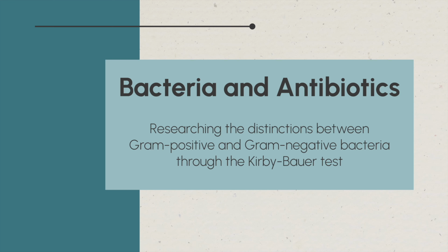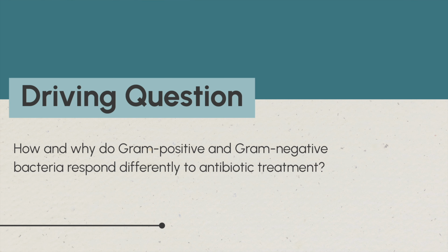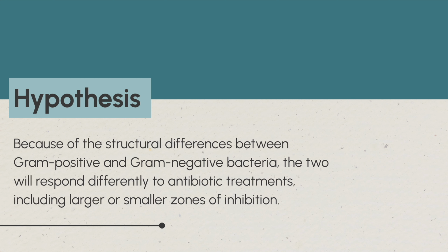I'm from Harmony School of Advancement, and my partner's and my PBL project was on bacteria and antibiotics, researching the distinctions between gram-positive and gram-negative bacteria through the Kirby-Bauer test. Our driving question was how and why do gram-positive and gram-negative bacteria respond differently to antibiotic treatment? Our hypothesis was that because of the structural differences between gram-positive and gram-negative bacteria, the two will respond differently to antibiotic treatments, including larger or smaller zones of inhibition.